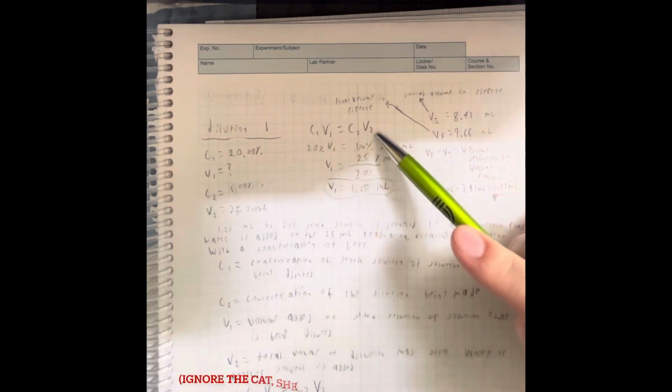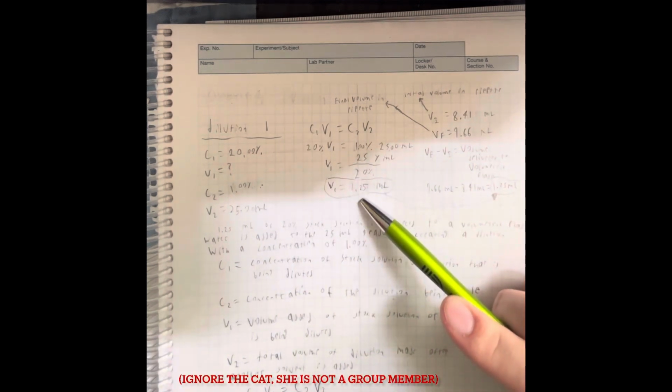V2 is the amount we are going to dilute to. Since we are using a 25 milliliter volumetric flask, this is going to be 25 milliliters. After plugging it into the equation, we find that the V1 we need is 1.25 milliliters.